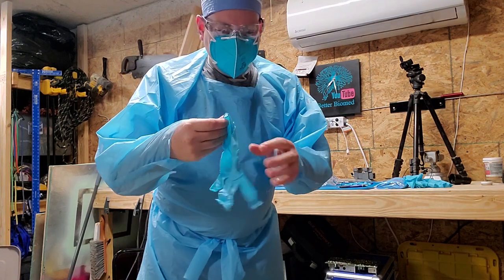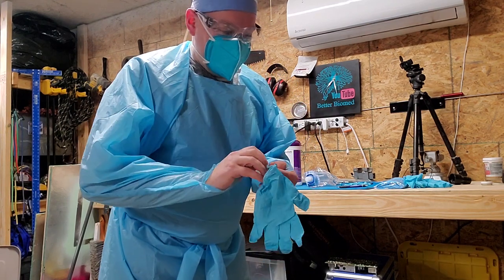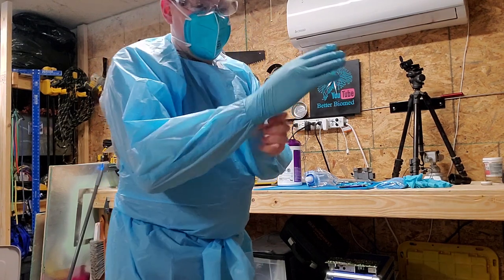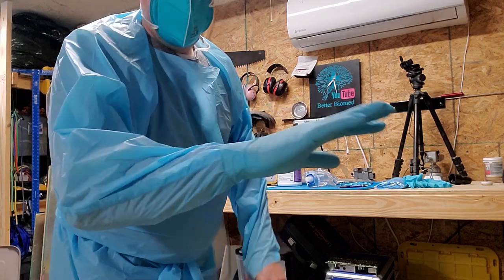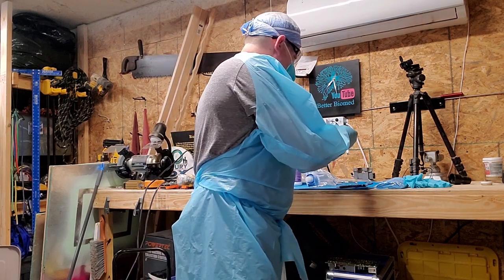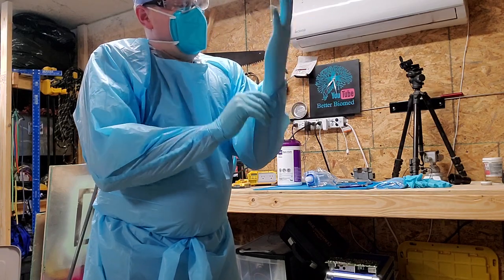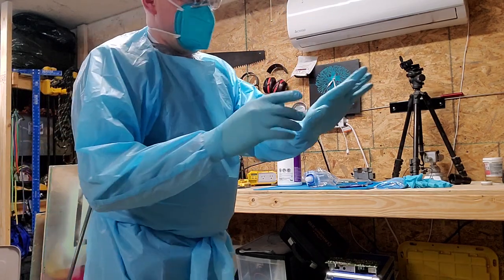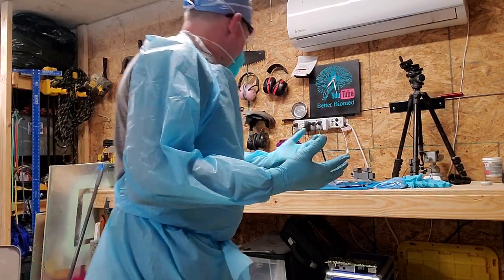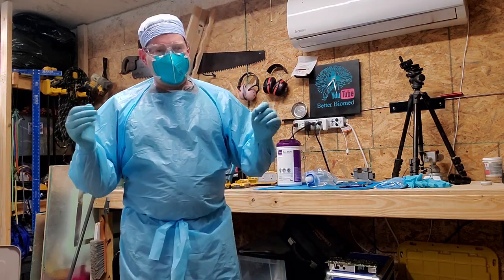Now the next step that you're going to do is take your gloves. Make sure you don't tear your gown. You're going to fit your glove up and over the sleeve. Make sure there's no skin showing. Do the same with the other hand. Make sure you use a large enough size glove that you're not putting stress on the sleeve to tear it. And that is me ready to enter into a COVID ward.